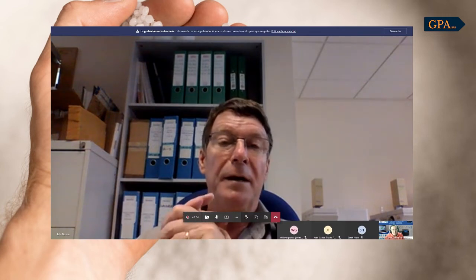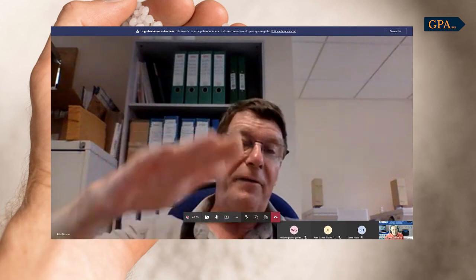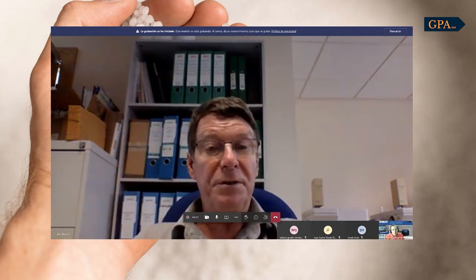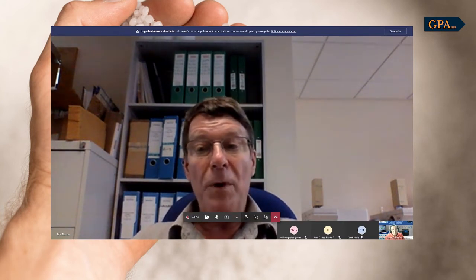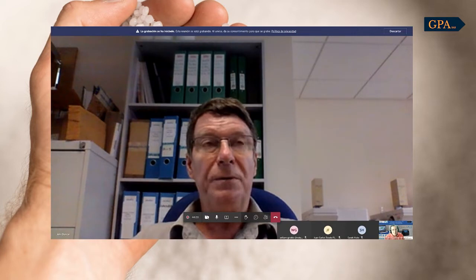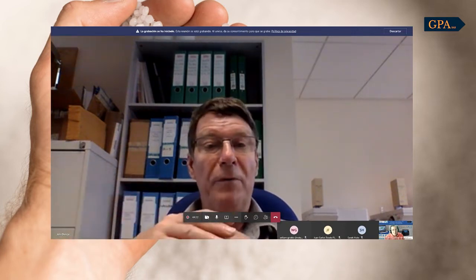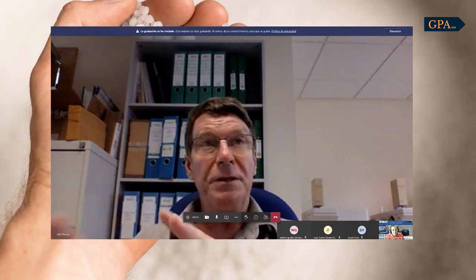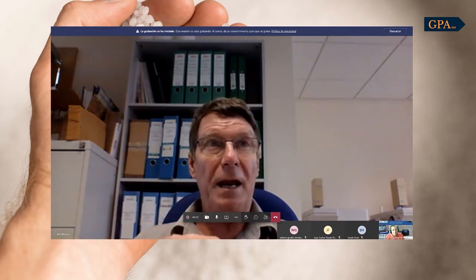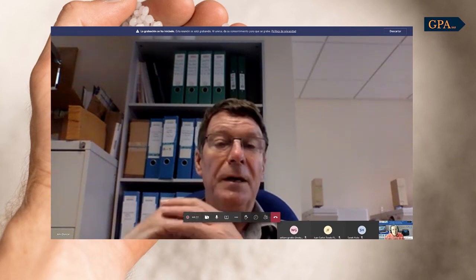When it does that, we can record the data of how it squashes in, which of course depends on the viscosity of the material. And we have an algorithm that lets you compare the measurement we make with the melt flow index. Because it's a very different measurement from the melt flow index, we do have to calibrate the instrument with known MFI material. We have to do that first.